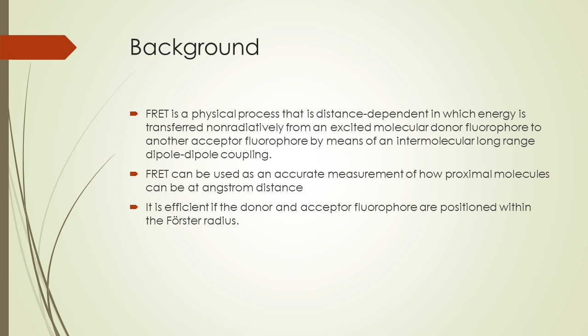Fluorescence resonance energy transfer is also referred to as FRET. FRET is a physical process that is distance dependent, in which energy is transferred non-radiatively from an excited molecular donor fluorophore to another acceptor fluorophore by means of an intermolecular long-range dipole-dipole coupling. FRET can be used as an accurate measurement of how proximal molecules can be at an angstrom distance.